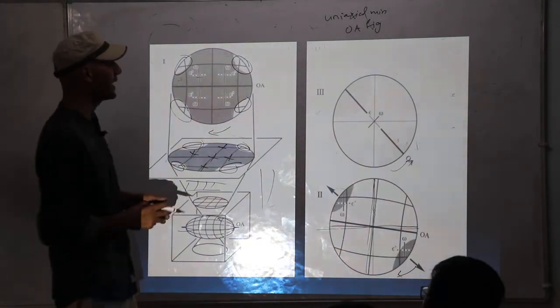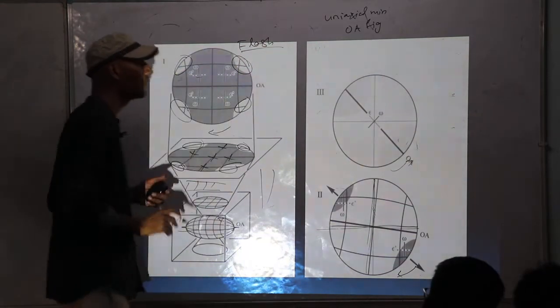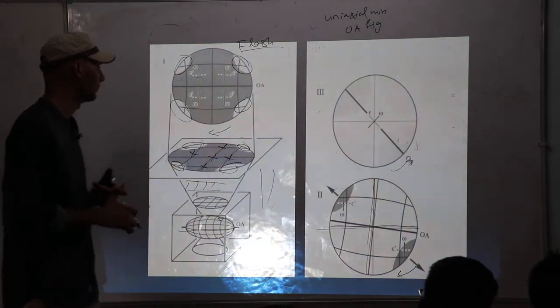So this is known as flash figure. That's why it is known as flash figure. It is obtained for a very short time. If you rotate the stage, it occurs for an instant.